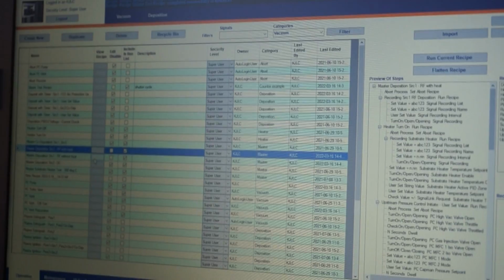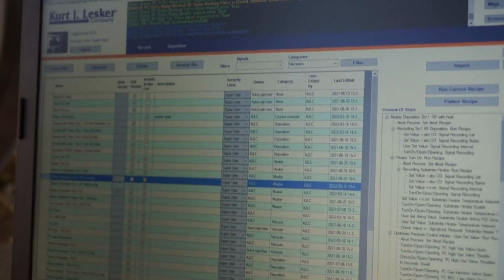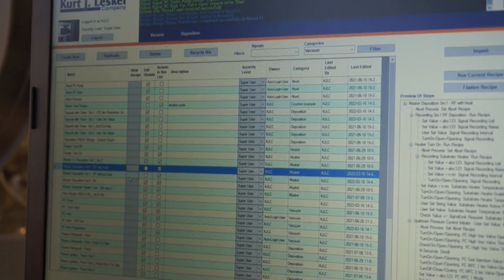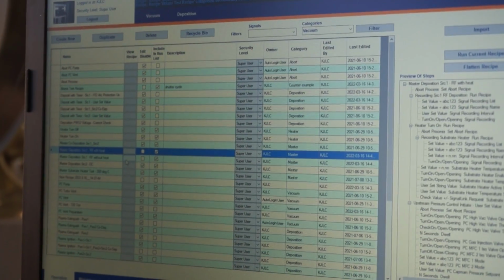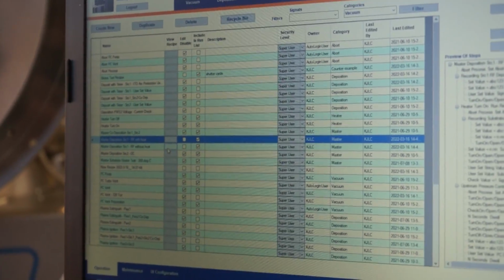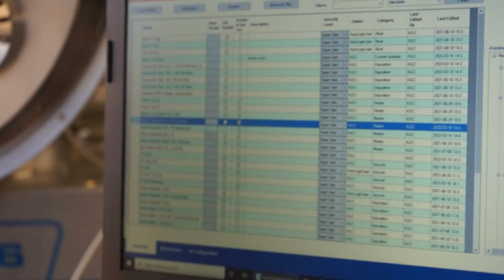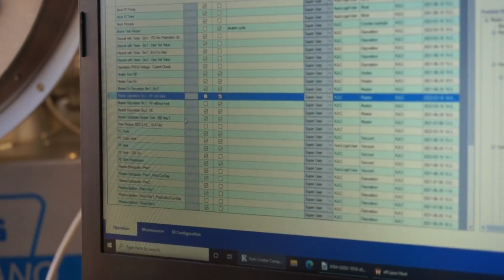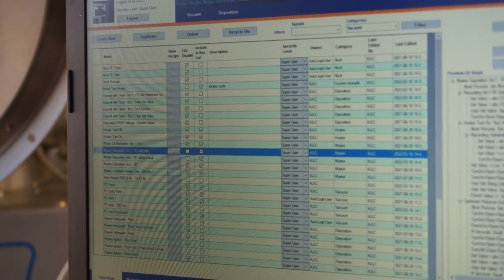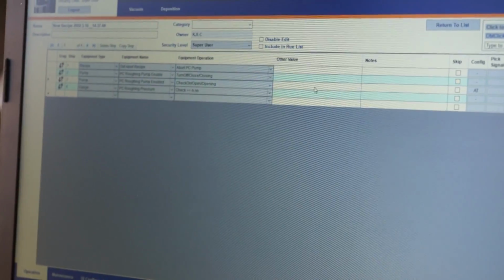You want to run ITO, it seems like. So, do you have any other targets than the aluminum one you have in here that's 2-inch? No, we have 4-inch VO2 one, right? Yeah. But he has the recipe, right? He has the recipe used last time. Oh, the operating condition? Operating condition. Yeah, I put it in. Because each system, I understand, is a little different, so maybe there's some settings that are slightly different.